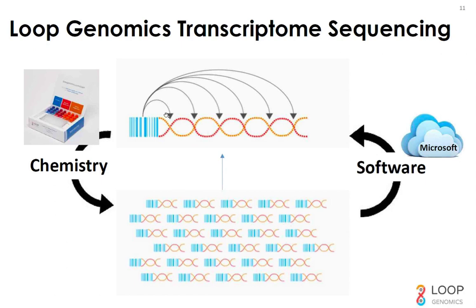So after we do the intramolecular barcode distribution, we then go on and prepare the library for sequencing using the regular short read sequencing workflow, where molecules are just chopped down to 200 or 300 base pairs, the read length of Illumina sequencing. And what we generate are these short reads that you can see here. In the library that we load on the sequencer, every short read always starts from the loop adapter followed by the actual sequence of the molecule.